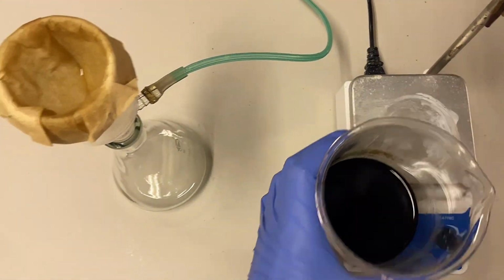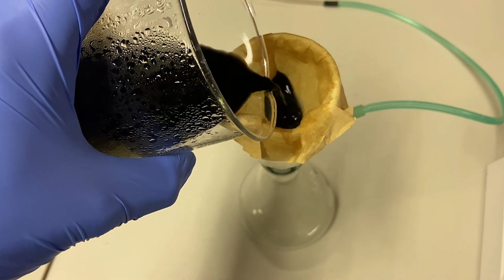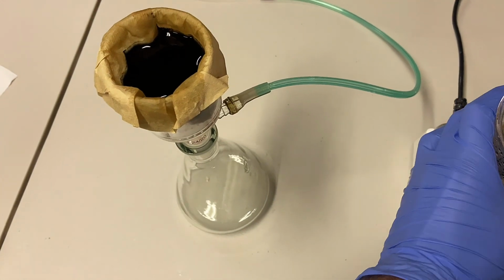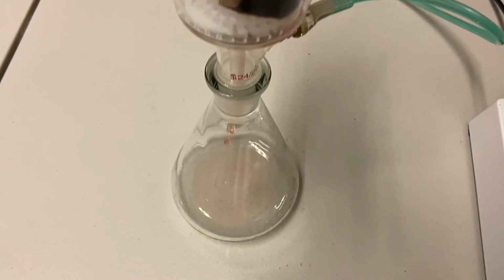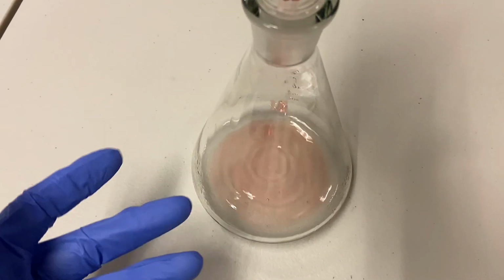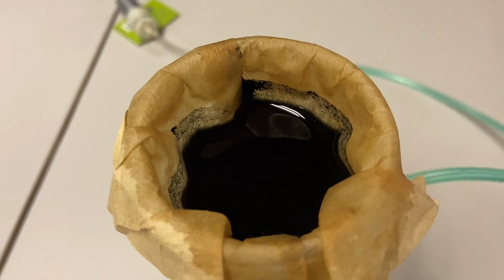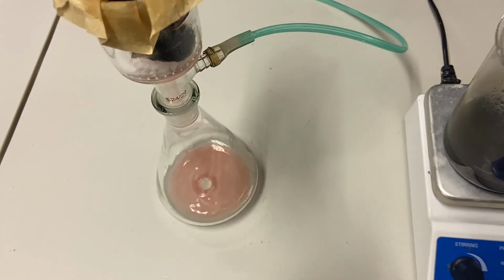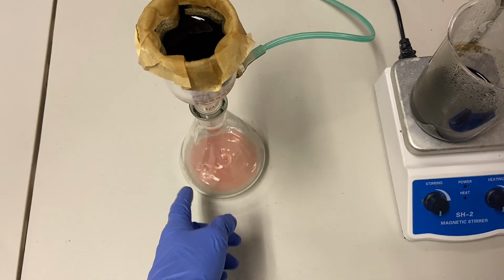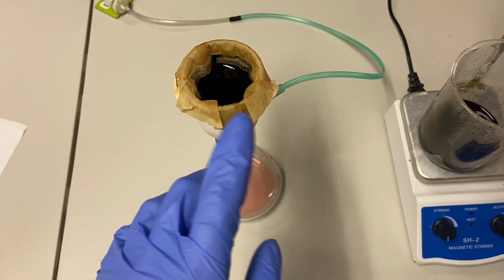So what I'm going to start doing now is slowly filtering off this manganese. The first bit, the liquid, shouldn't be too big of a problem. There we go. And eventually I'll get down to the bottom and there will be a whole bunch of manganese in the bottom of this beaker. And what you can see is that once it's filtered, the liquid goes back to being that red color with the cobalt and the lithium and nickel in it. And that is a good thing. That is exactly what we want to see. And you can start to see up here bits of manganese all around the edge. So I'm going to filter all of this off, and then I'm going to jump back in with the camera when it's done, and we should have a beaker with our solution to keep doing chemistry with, and we should have very pure manganese dioxide completely filtered out.